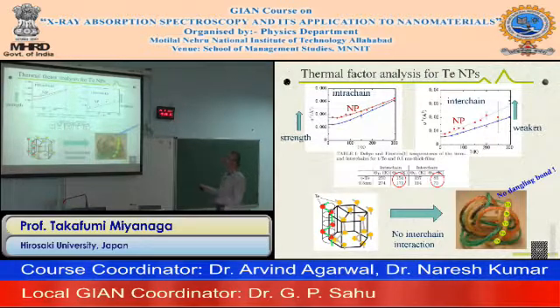Another one is the interchain. The interchain correlation changes between the crystalline and nanoparticles. This inclination increasing means the bond is weakened. So we can compare the Einstein temperatures or Einstein bond strength like that. So the strength of the interchain weakens as it goes to the nanoparticles. So our rough model is that the crystal structure changes to the Young models.